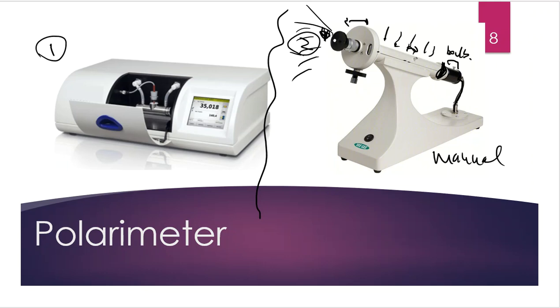And then typically on this rotating piece that you turn, you will record the number on the meter and the amount that you turned it. And again, you write down positive if you turned it clockwise towards your right hand, and you write down negative if you turn it counterclockwise or towards your left hand. So as we turn to the right-hand side, positive would be in that direction. As we turn left-handed, negative would be over here on the left-hand side. All right, so that is how we would use a manual polarimeter.